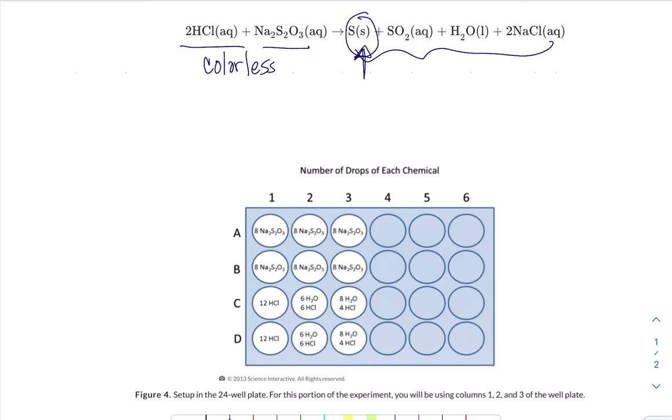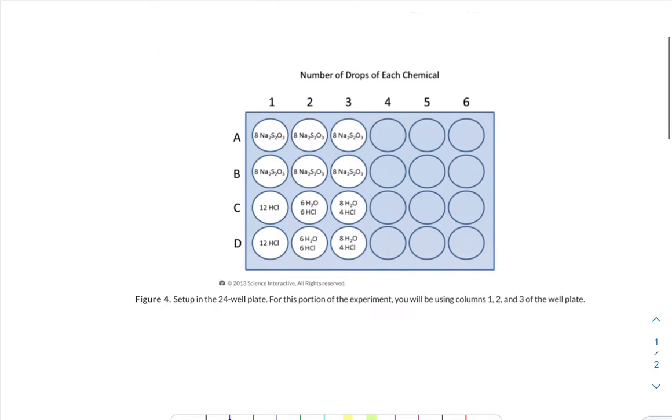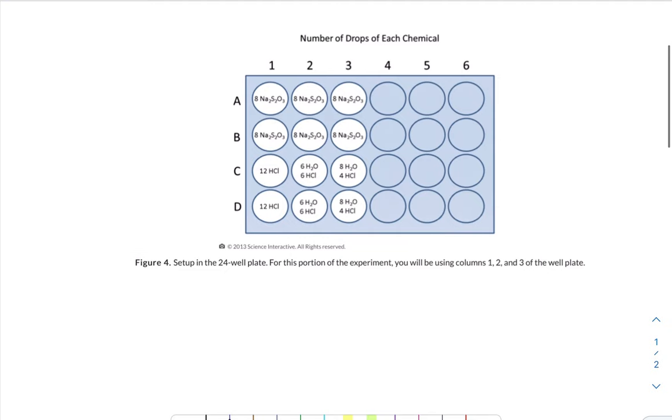When this X becomes invisible because the yellow solid has precipitated out and obscured it, you're going to call time and say the reaction is finished at that point. This is what the spot plate looks like for you to run your reaction. Please double check the number of drops of each, because sometimes Science Interactive changes something in an experiment and I always find out about it after the fact.